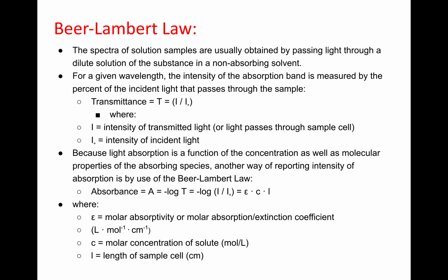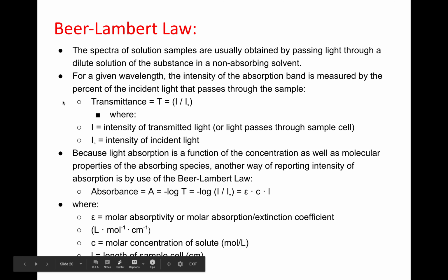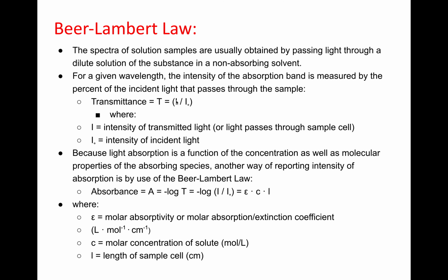One question I have is how to get the concentration of the DTC. Okay, so how do we get the concentration based on our data? Well, our data will give us the absorbance, okay? We know the transmittance is the intensity of light that's transmitted divided by the intensity of light that's incident on the sample, okay?